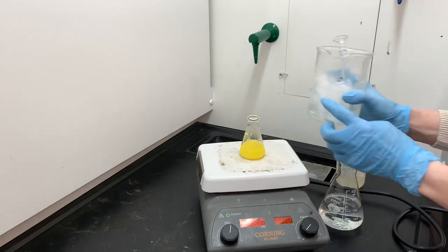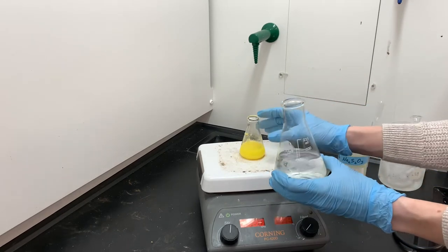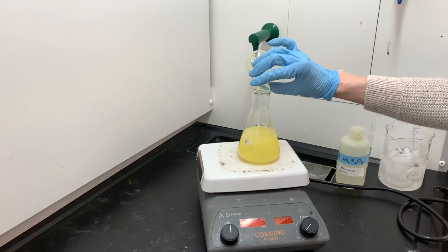I'm now gonna use some ice cold water to start the precipitation process. This large Erlenmeyer flask has some ice cold water in it. I'm gonna transfer our product into this ice cold water. And again, this is just gonna help to start the precipitation.